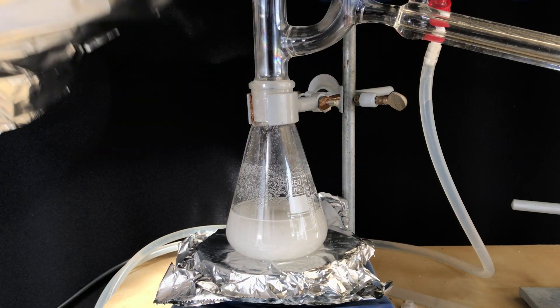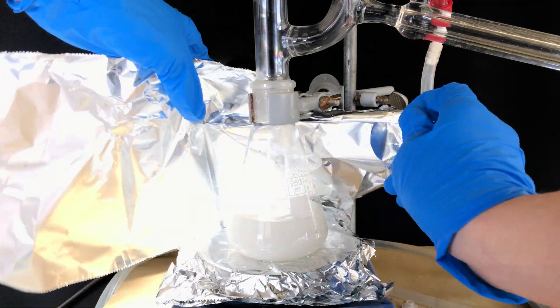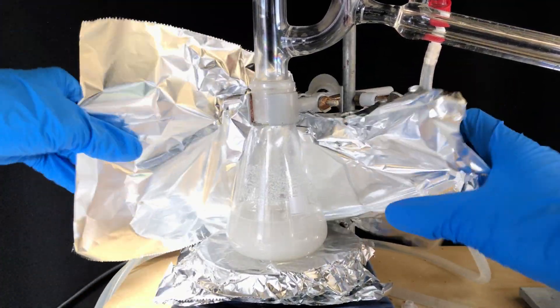As it is extremely cold outside, I hoped to help the reaction along by wrapping the apparatus with aluminium foil.